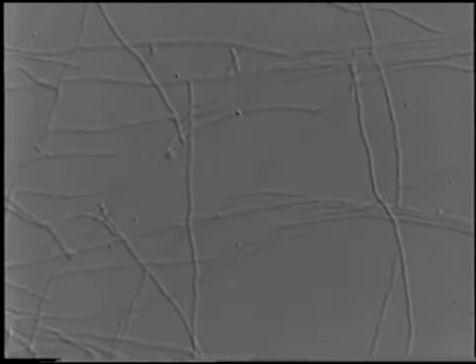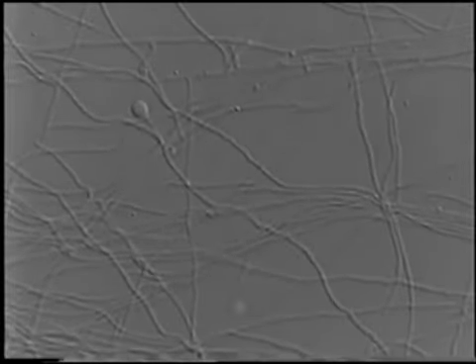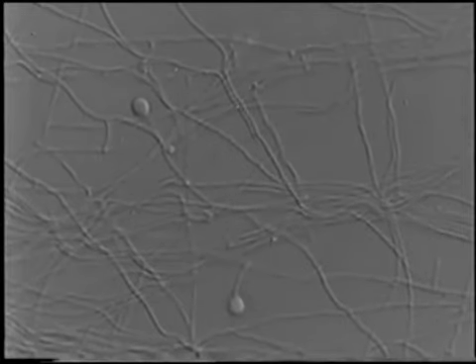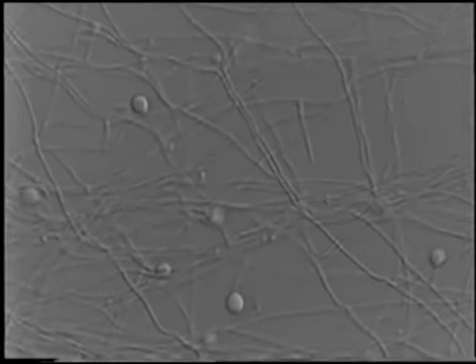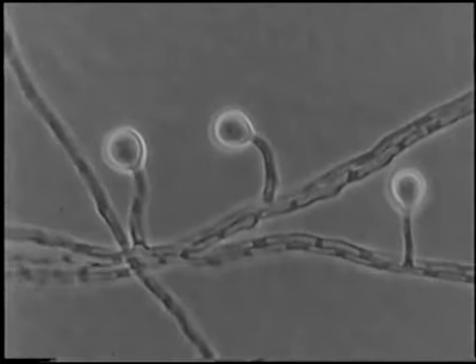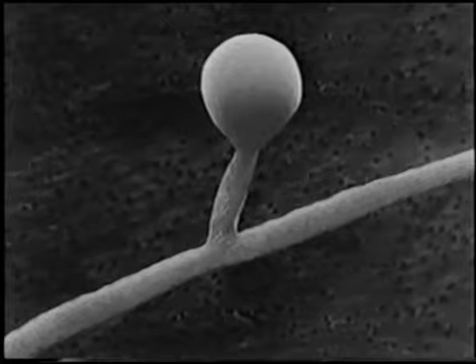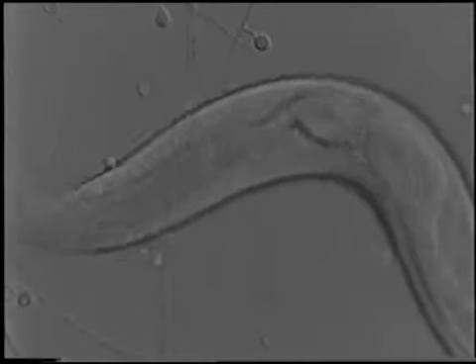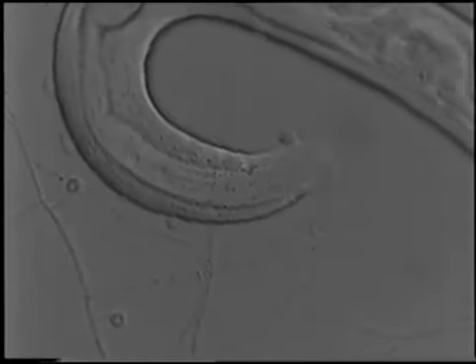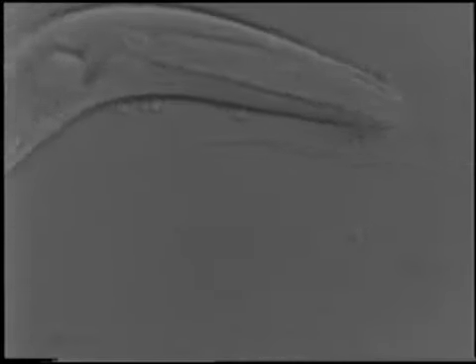The first example of a nematode trapping fungus is Dactylaria candida. On the growing mycelium, 2 to 3 micrometer wide adhesive knobs are formed. They arise at the end of a delicate stalk. Here, these spherical traps are seen in the scanning electron microscope. Sometimes the traps are detached from the mycelium and carried away by the nematode. In other cases, however, the nematode is held on the mycelium by attachment to several knobs.